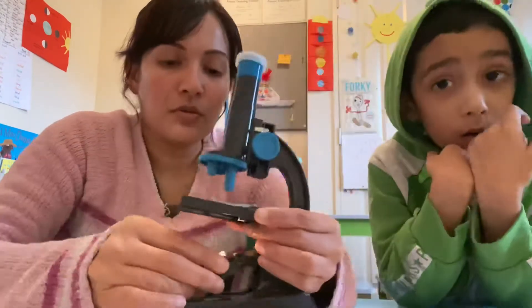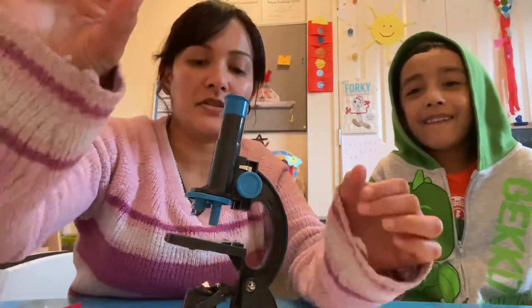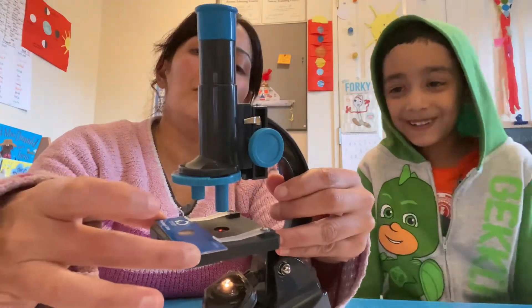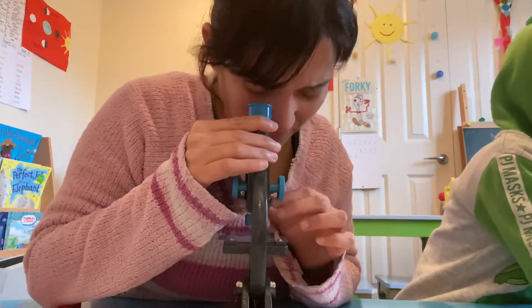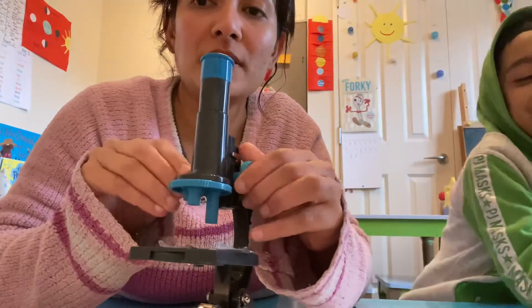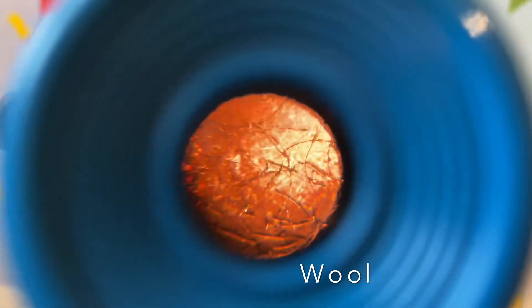I'm going to remove that and we're going to look through one of the prepared slides — we have the wool slide, so we're going to look at that. Always be careful when placing it in here; it just slides in smoothly like that. Looking through — here we have the adjustable knobs so you can move it down for a closer look or bring it up. That's the wool! They look like strands of hair.